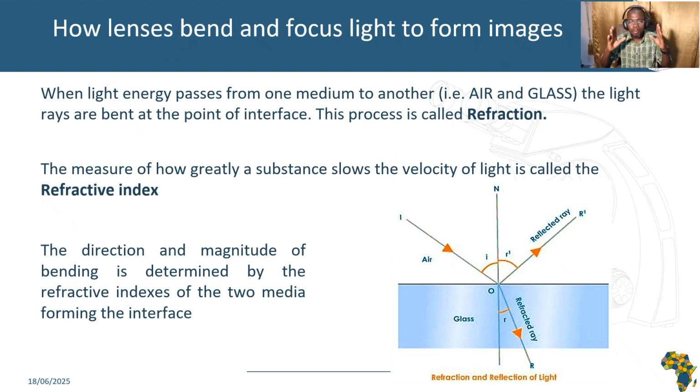How lenses bend and focus light to form images. In this context, it is important to differentiate between the terms refraction and refractive index. Refraction is the bending of light as it moves between different materials.